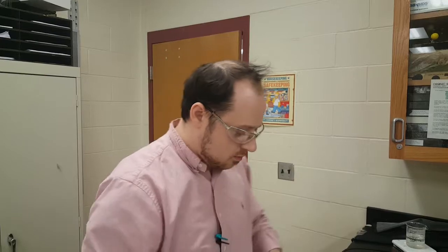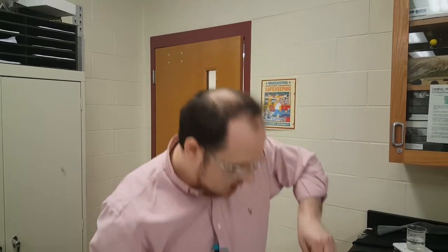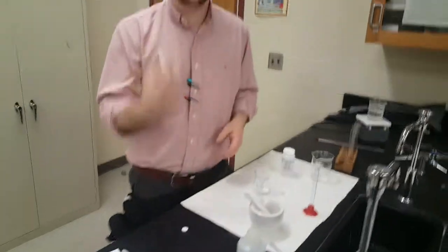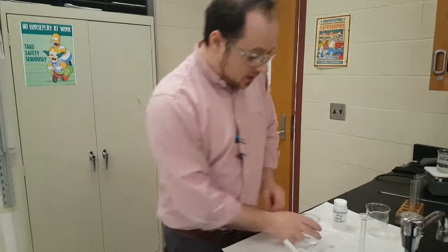Oop, a little more. Put that in your beaker. Add 10 mils of acid on top. Swirl. Another third whole tablet on top. Time it. See how long it reacts. Then you're going to clean that one up.